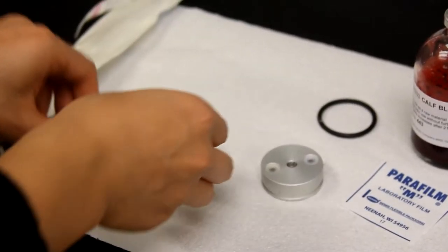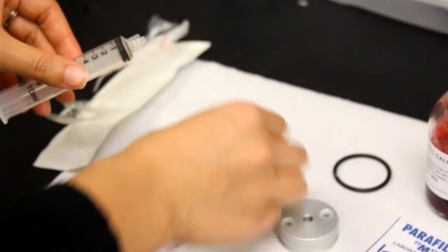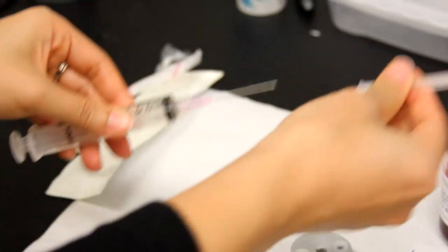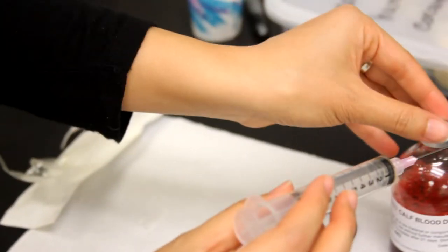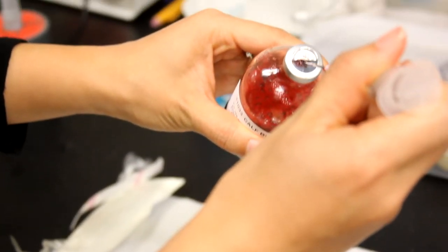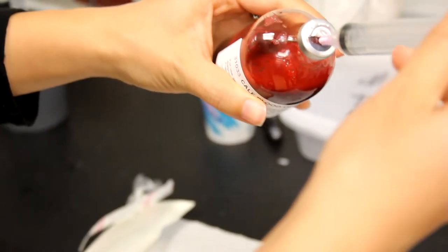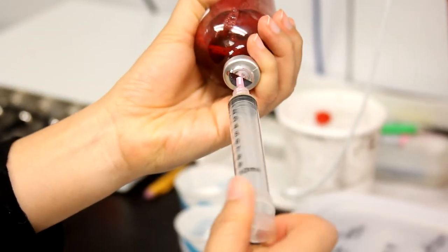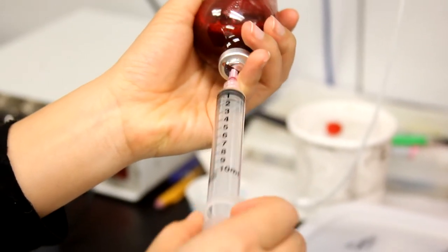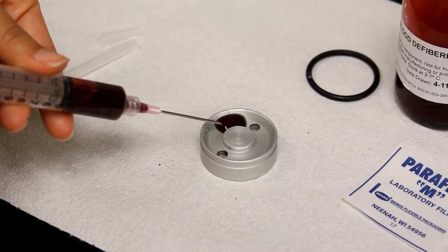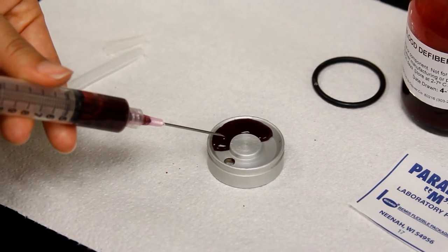Then assemble the needle onto the syringe and extract the amount of blood needed for feeding. The amount of blood used in the reservoir will vary on the amount of mosquitoes you are feeding. Small cages can be given 1-2 milliliters of blood, while larger cages can be given 3 milliliters of blood. Using the syringe, fill the reservoir with the defibrinated calf blood.